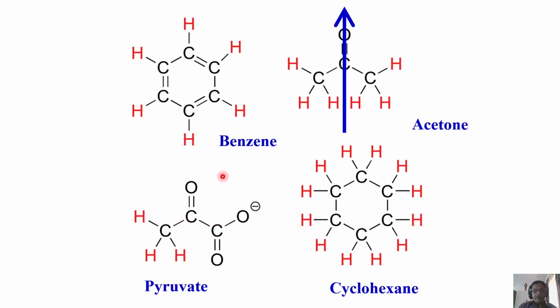But if you look at the carbons of this molecule, because it lacks any type of symmetry, all the 3 carbons are chemically non-equivalent. As a consequence, in carbon 13 NMR, you get 3 peaks. But in the proton NMR, you get only 1 peak.